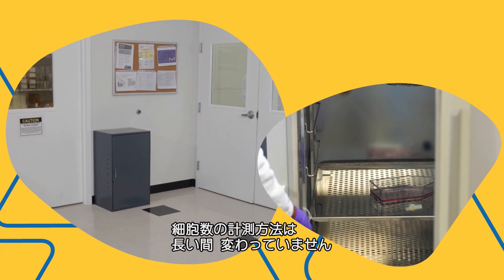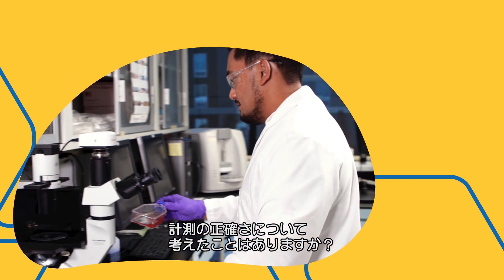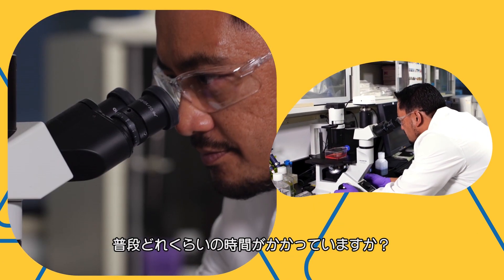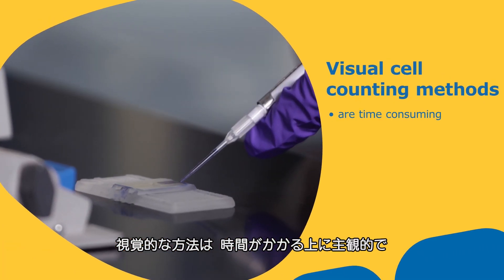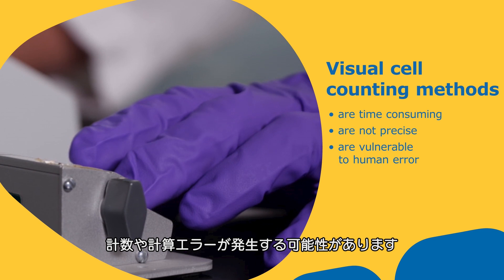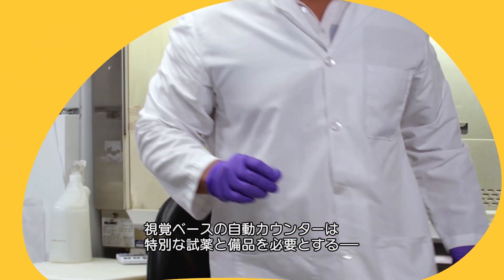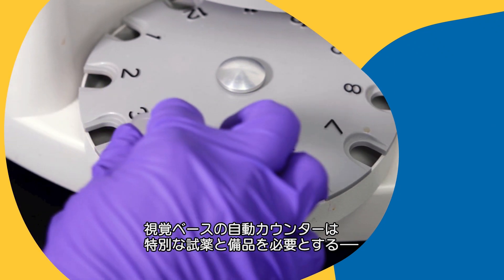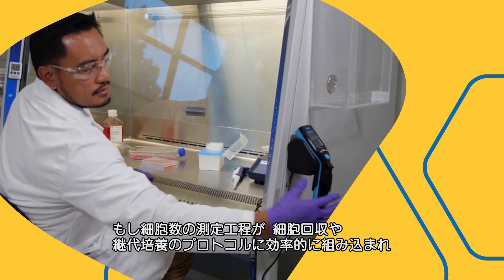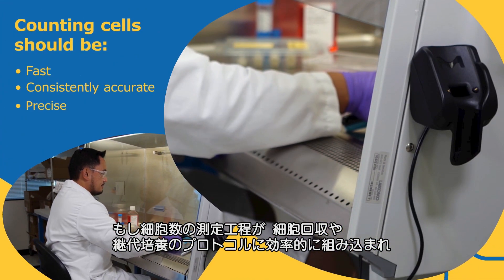You may have counted cells the same way for a long time without giving much thought to the accuracy of your method or how much time it takes out of your day. Visual methods are time-consuming, subjective, and at the highest risk for counting and calculation errors. Bulky vision-based automated counters are often large, costly instruments that require special reagents and supplies. What if counting your cells was an efficient, integrated part of your cell collection or passage protocol?